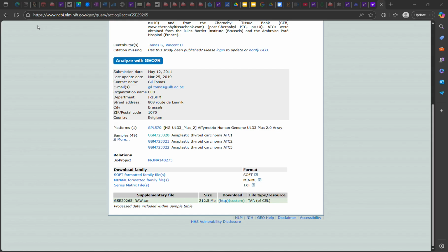Now, next up, we're going to go into normalized expression. Unfortunately, I did the same thing here that I did for feature data, which is I've made the new normalized expression the same name as the old normalized expression. So just to show you what's going on, let me click on the old normalized expression. This is the old normalized expression. The numbers down here, the file names up here. Basically, what we need to do is flip the file names and the column names using the probe ID. So I'm just going to run this.